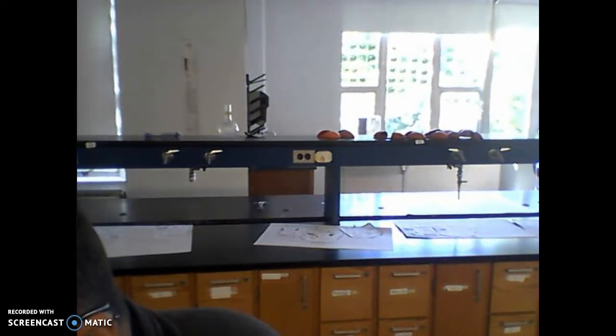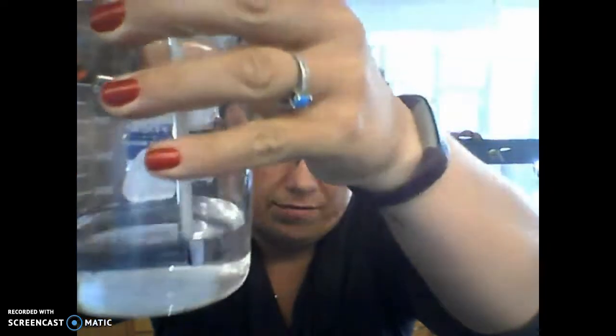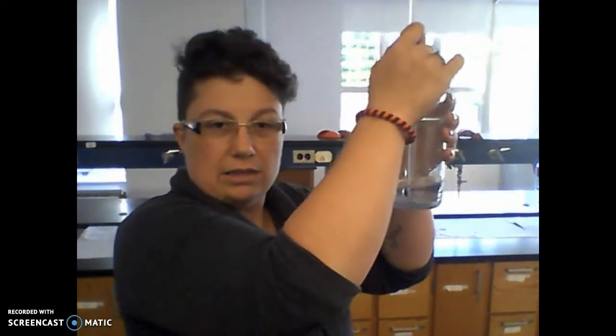When we use the thermometer, put it in the liquid and hold it suspended — do not set it against the glass because then it takes the temperature of the glass. Hold it in the middle, not touching the sides, not touching the bottom. Hold it there for one minute — not 30 seconds, but one full minute. Then keep it suspended in the water, bring it to eye level, and take the reading.